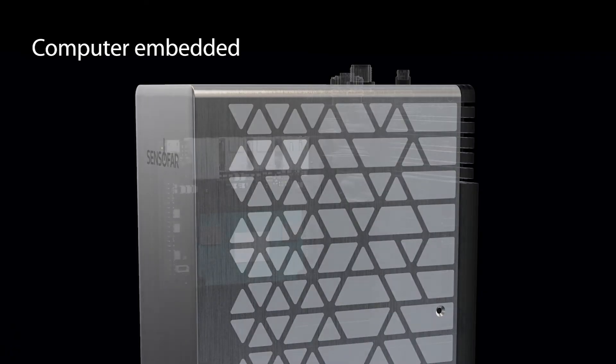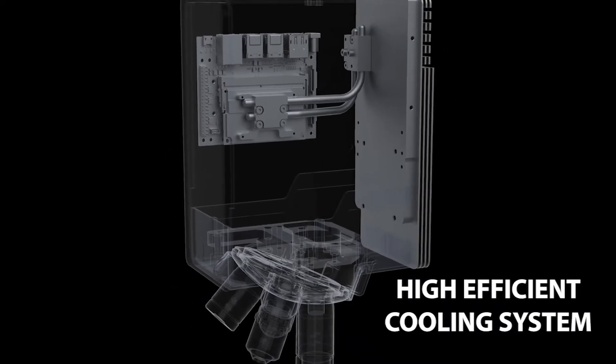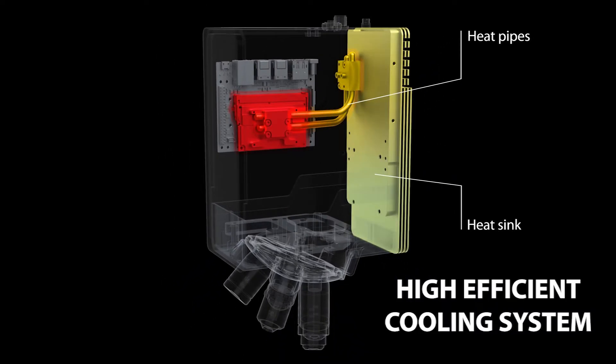The head has an embedded computer and also a high efficient cooling system, all of that without compromising its size.